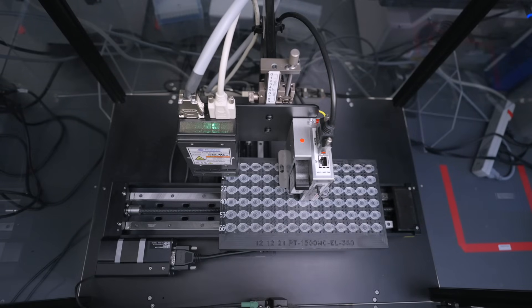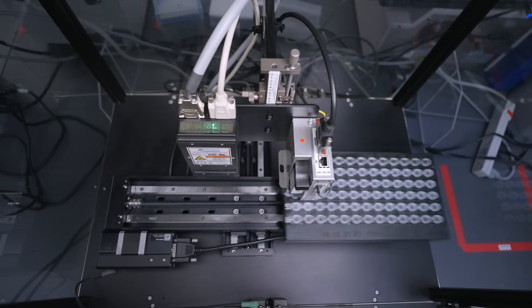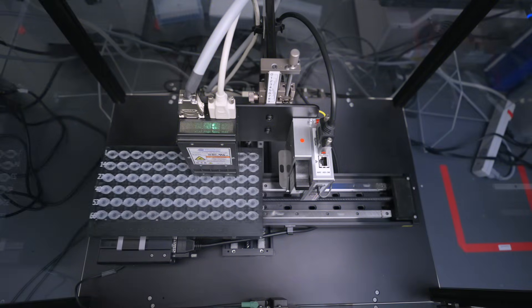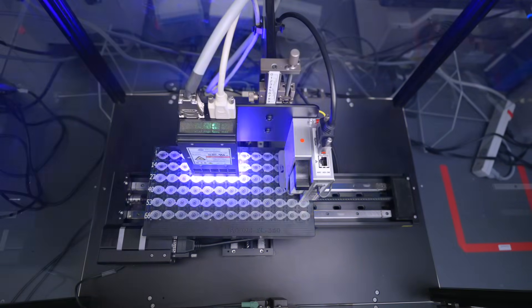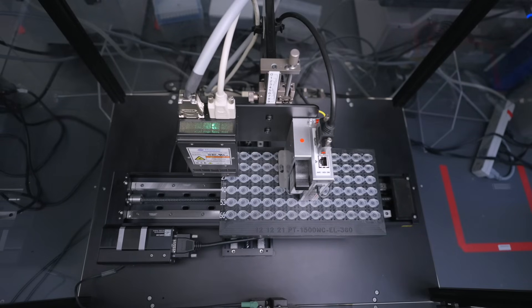With fast mode, it accelerates tube printing for high throughput tasks like aliquoting and sample prep. It's super great for short-term studies, daily aliquoting workflows, internal tracking, and solvent resistant workflows.